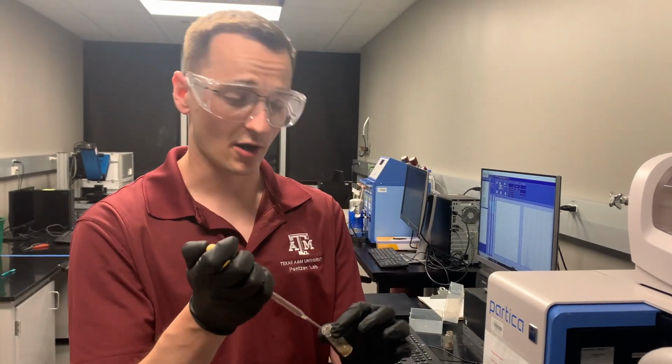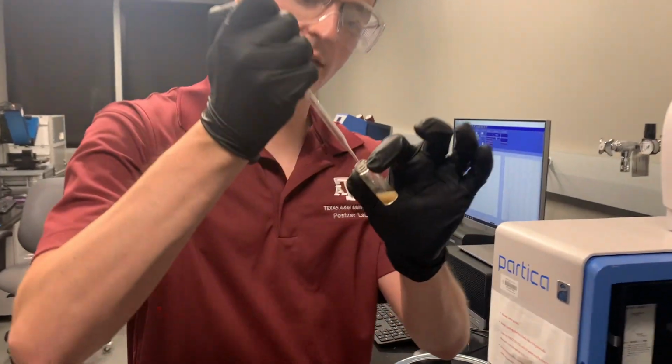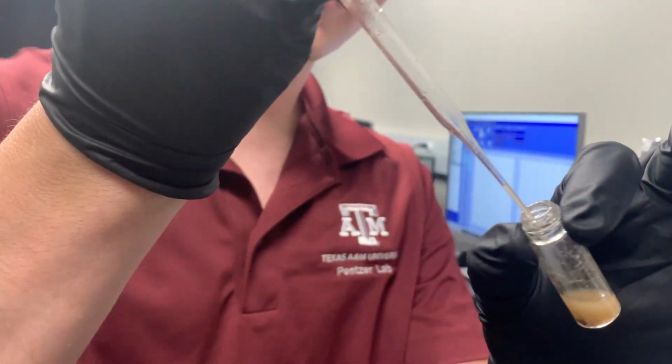So the next step is to go ahead and load our sample into the fraction cell. We begin by taking just a small aliquot of our sample and gently place it inside of the fraction cell. At this point, you can go ahead and agitate the mixture a little bit because some of the particles will settle out faster than others. This is just to ensure that a nice even measurement can be collected by the instrument.